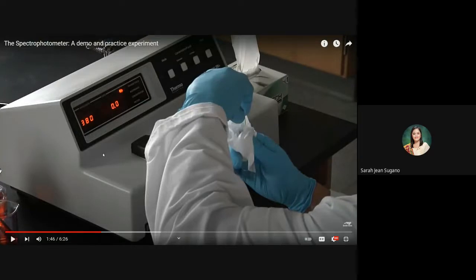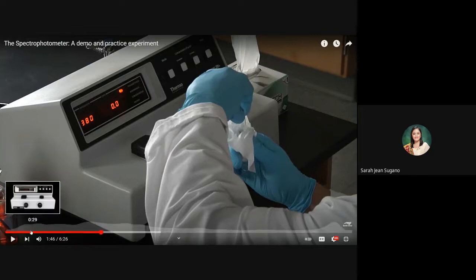You can use distilled water, but there are other laboratories. It's what I have experienced from the UPLB. We have used the deionized or triple distilled water, in which there are no ions that can interfere with the absorption of light. Otherwise it can give absorbance because there are compounds that really can absorb the light, so it will have a reading of absorbance. So it is really preferable that you use triple distilled water. There are no traces of metals or ions present in the blank sample. Okay, so that's your reference point.